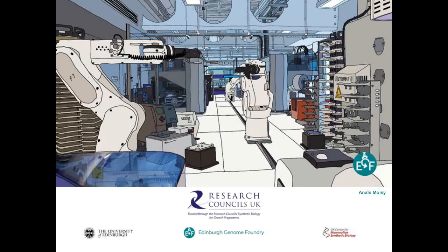You said that the software can decide how many colonies to pick, but what is the typical number? It's kind of like what I described earlier. It varies based on the complexity of the assembly, but typically it varies between 6 to 12.